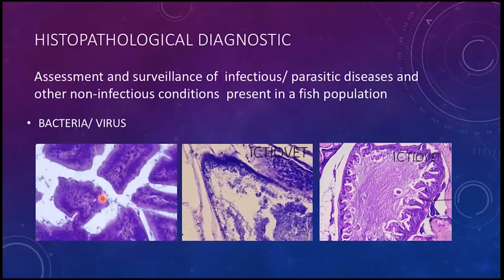So through histopathology, we are capable of seeing if there are, as in this case, filamentous bacteria associated to the intestinal epithelium, the intestinal mucosa, that can potentially be a problem. We can also detect an over-proliferation of bacteria in the gut lumen, and a completely abnormal high amount of bacteria.